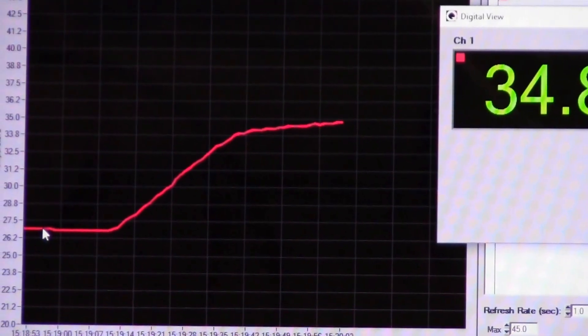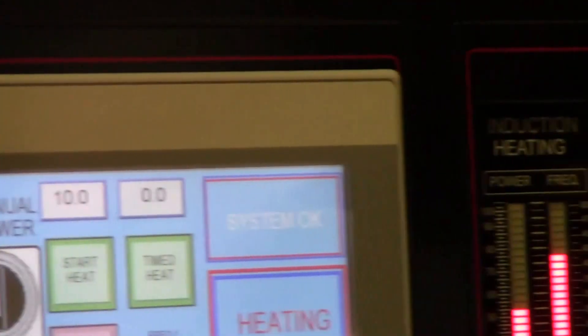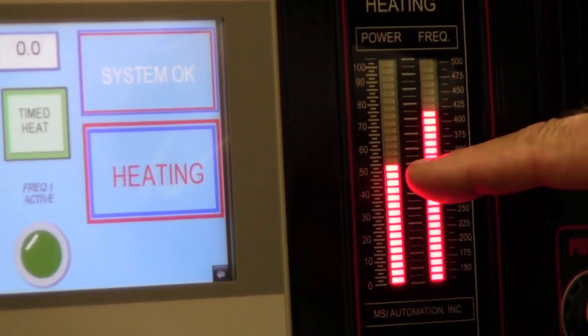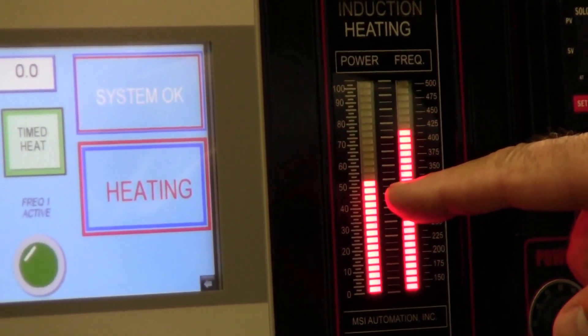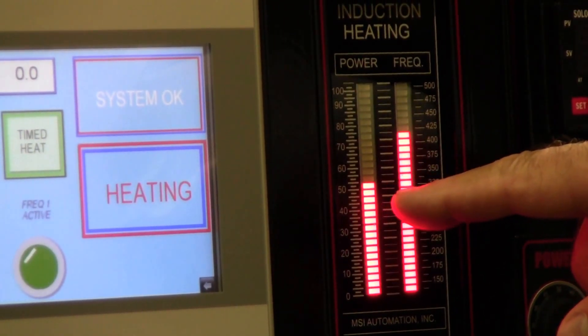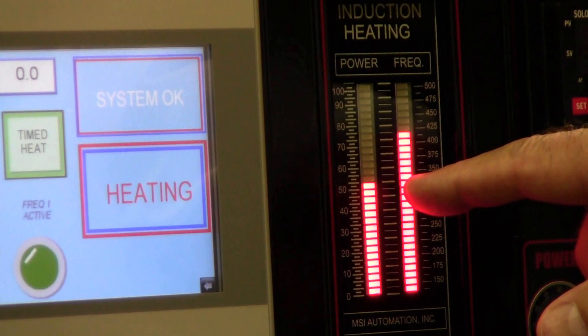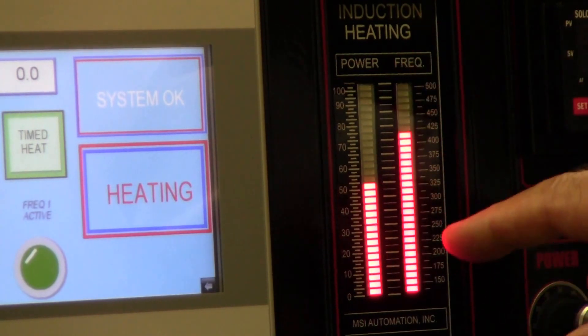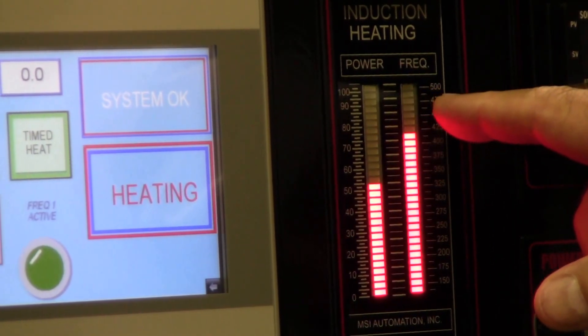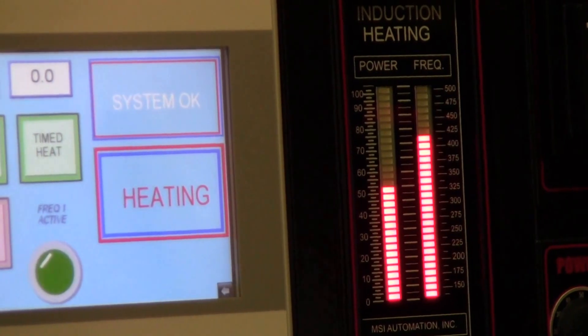And if you scan back at the control system, you can see that the power has been automatically reduced to maintain that temperature. Otherwise, were it not to be controlling the temperature, the power would still be at maximum, and we'd be close to 40 degrees centigrade.